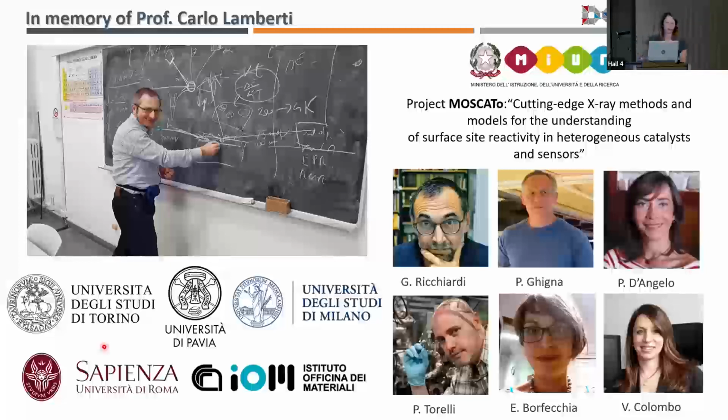With the aim of developing a new X-ray absorption technique at the Elettra Synchrotron in Trieste. He then suddenly passed away in 2019, unfortunately, but the group has worked a lot on this project, and we are still working on it. So I would like to show you some of the results we have obtained in the development of this new technique, and show you that this is the reason why we are moving also to X-ray absorption experiments.